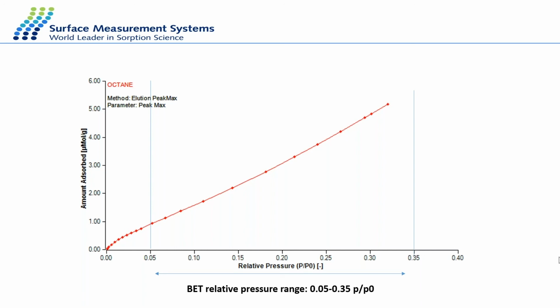So it's not limited to our recommendation. These are just the probes that we use, based on the literature. But of course, science has improved now, and there are other ways to measure surface tension parameters of liquids. So if you have new values for other polar solvents, you can enter them into the analysis software.